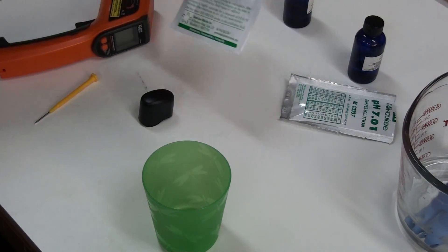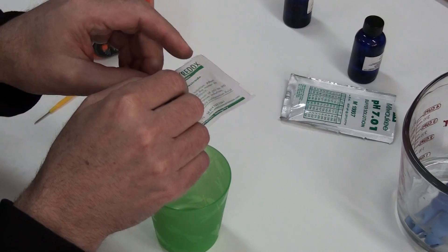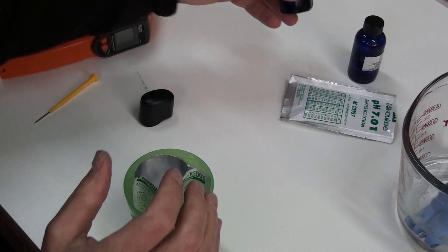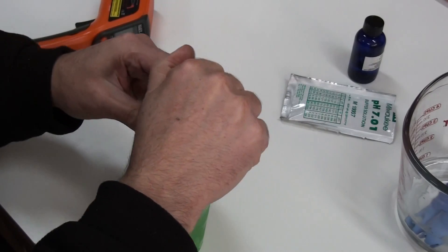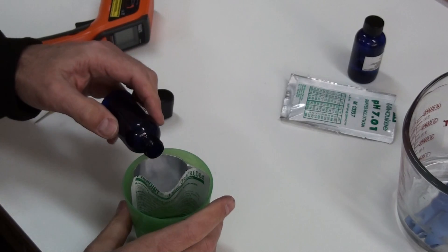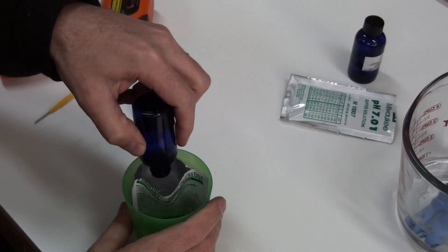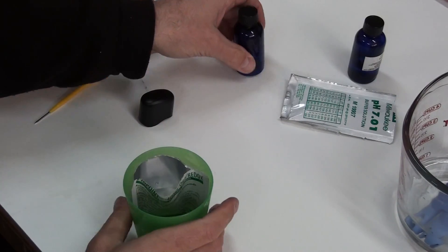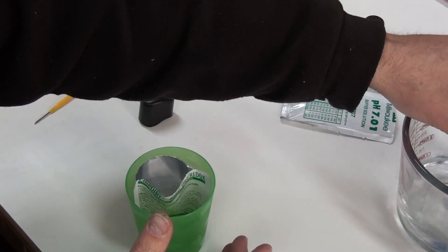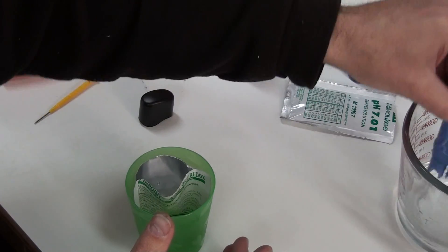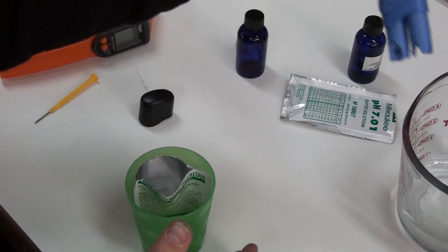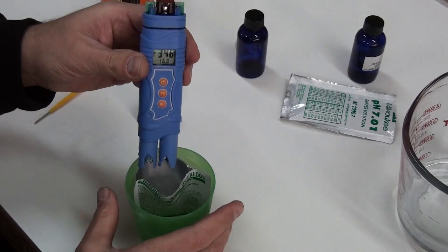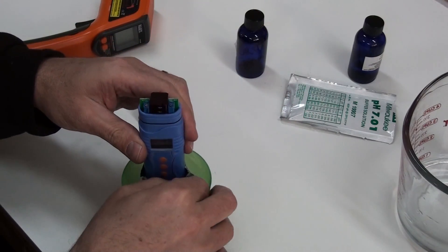All right, next I'll do the ORP. We'll do this the same way. Take the 400 millivolt solution. Pour it into the packet here. All right. Okay, we'll switch our meter over to the ORP scale. Stick it down into the solution.